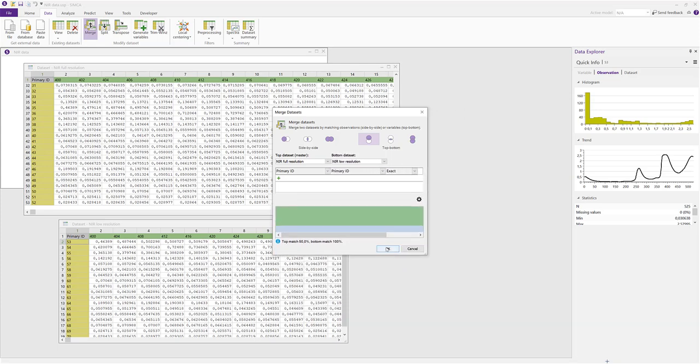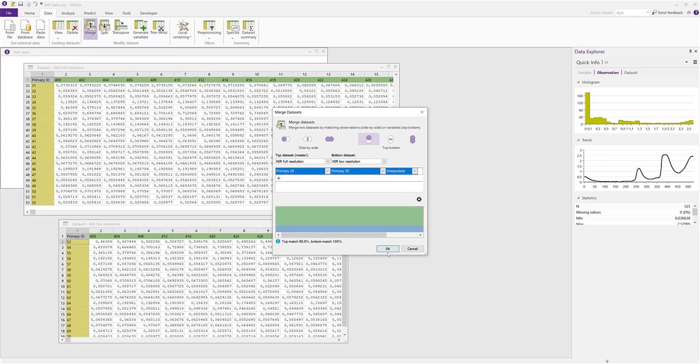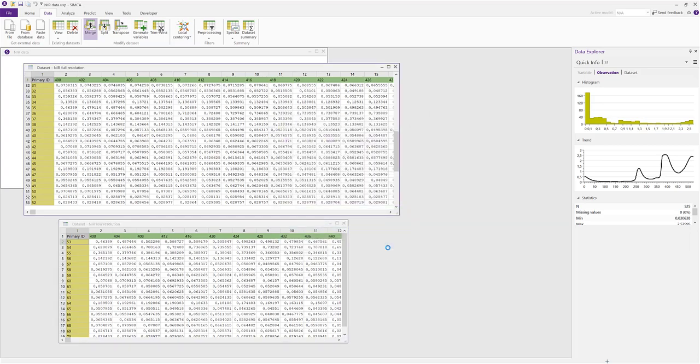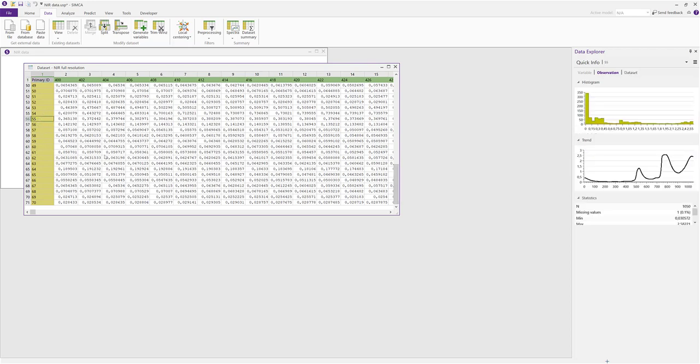Since the wave numbers are in the primary ID, we don't need to change the selection of rows here, but instead of an exact match we want to interpolate over the gaps in the data. So the low resolution data set now disappears and the observations 53 and onwards can be found inside of the full resolution data set. We can see that the interpolation has made complete rows.